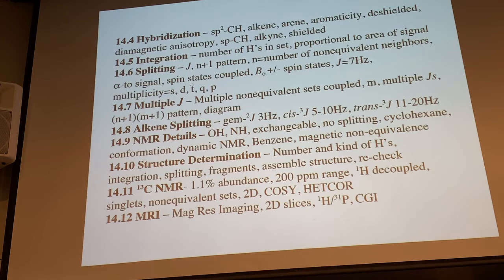And then the splitting pattern, if that wasn't enough, we have another concept in NMR that's very powerful. This idea of splitting. This is the n+1 rule. N is the number of neighbors in the non-equivalent set nearby, okay? Each little spin has its own little magnetic field that can add or subtract to the magnetic field that the set we're observing sees. So the signal that we observe is actually split into a multiplet pattern. It's either a singlet if it has no neighbors, if n equals 0. You see this mathematical equation is nice, n+1. You can't get any easier than that. If you have one neighbor, 1 + 1, it shows up as a doublet. It's split by that neighbor. If it has 2 equivalent neighbors, it has a splitting pattern as a triplet, 2 + 1, right? So the concept's pretty straightforward.